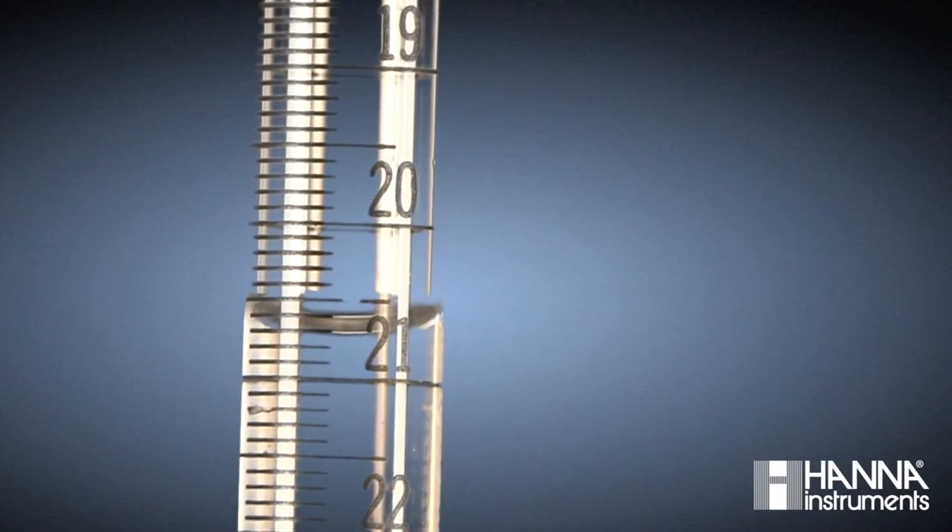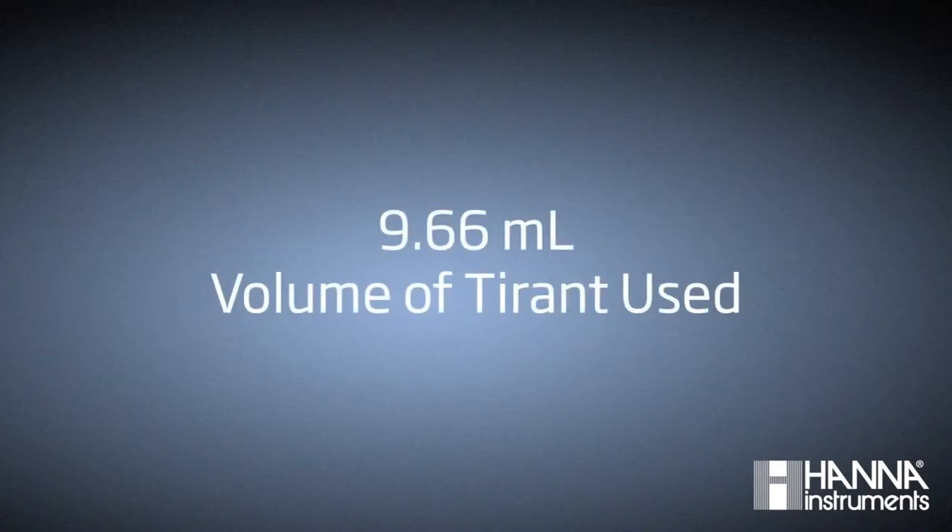Once we've reached our endpoint, we record our final titrant volume to be 21.28 milliliters. By determining the difference between our starting and final titrant volumes, we determine that 9.66 milliliters of titrant was used to reach the titration endpoint.